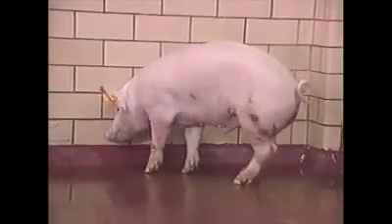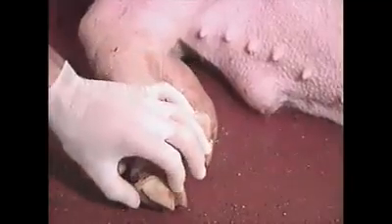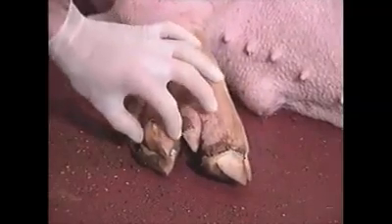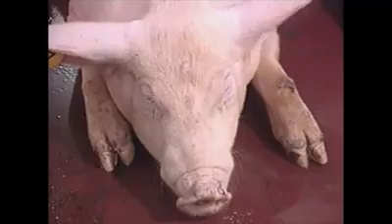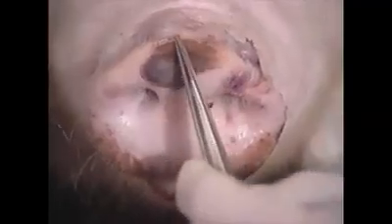This is the inoculated pig. The animal is very lame and the claws are very tender. Note how the coronary bands are eroded and the skin above the coronary bands of the claw and dewclaw has eroded. Note the large vesicles on the snout and eroded coronary bands. The vesicles on the snout are large and contain some blood. The skin around the vesicle on the front of the snout is brown and necrotic from a localized FMD lesion. This side view shows vesicles on the front and side of the snout.